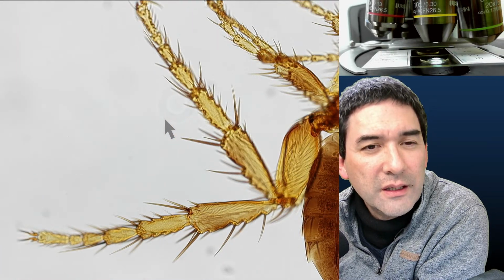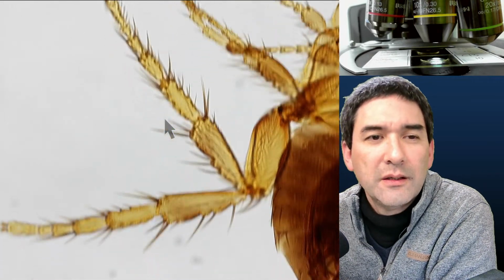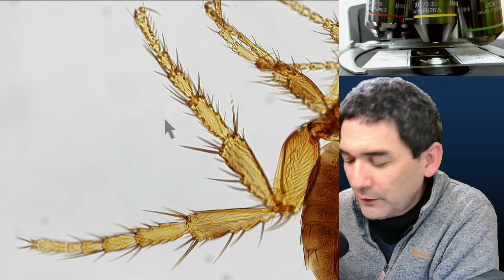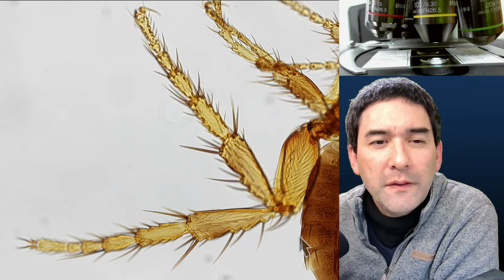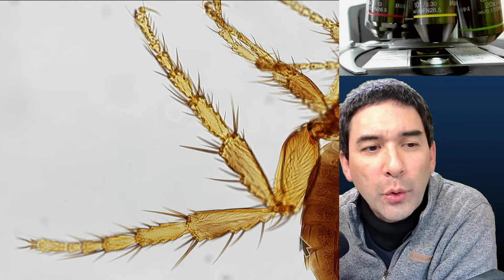And here I can actually tell you what the function is. It is very important for jumping, because those fleas, which are able to jump very far, make contact with the ground with the whole lower leg part.